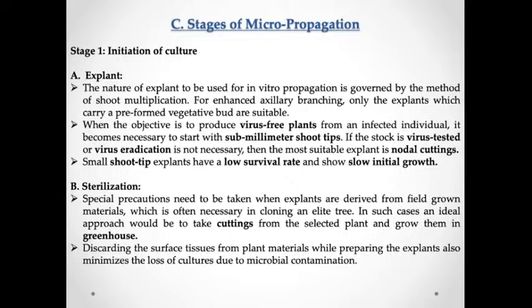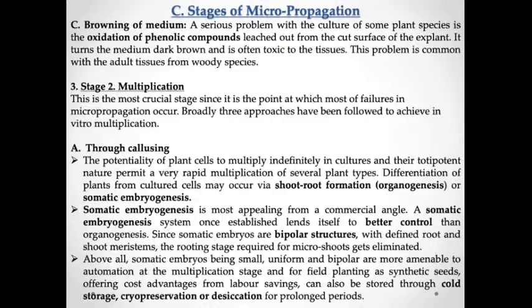Furthermore, sterilization has to be done on the parts of the cuttings from the greenhouse. Discarding the surface tissue from the plants while preparing the explant also minimizes the loss of cultures due to microbial contamination.